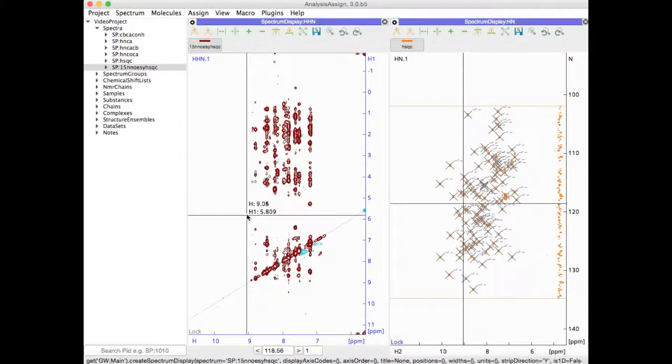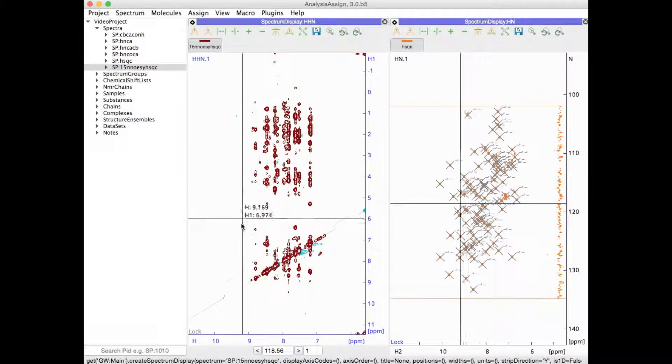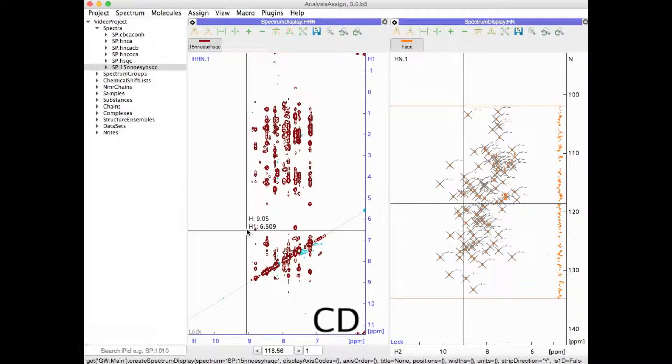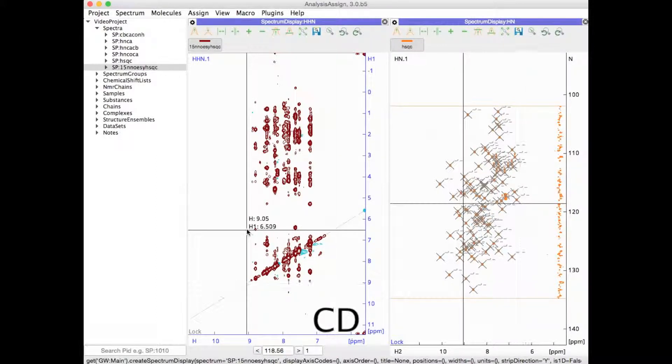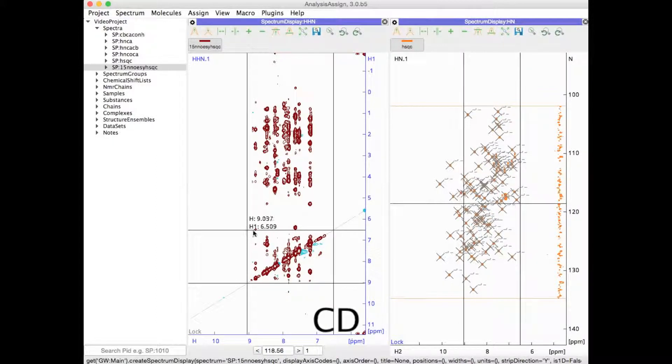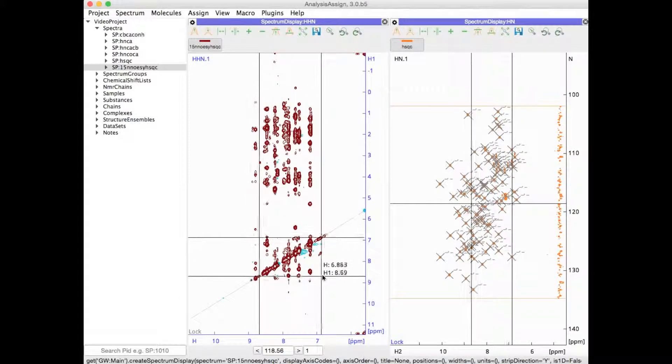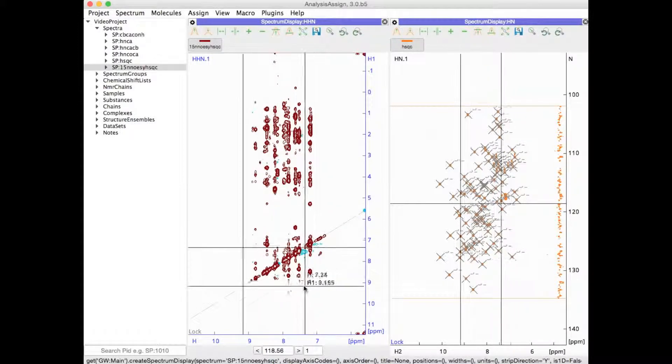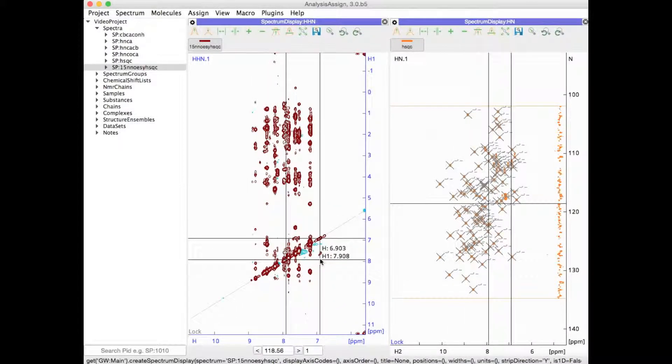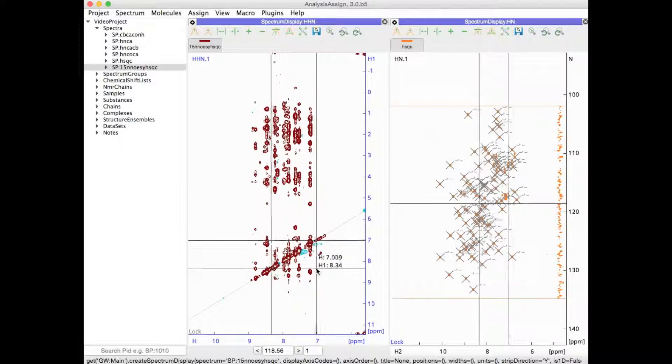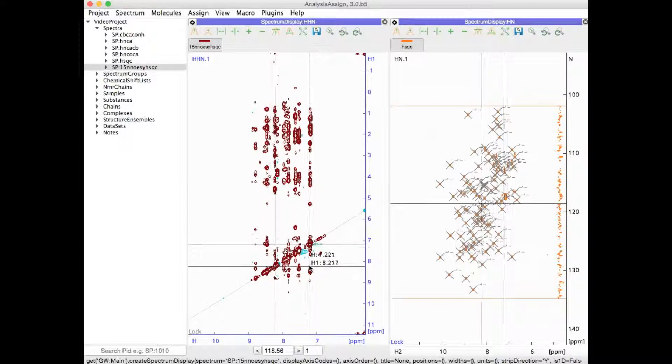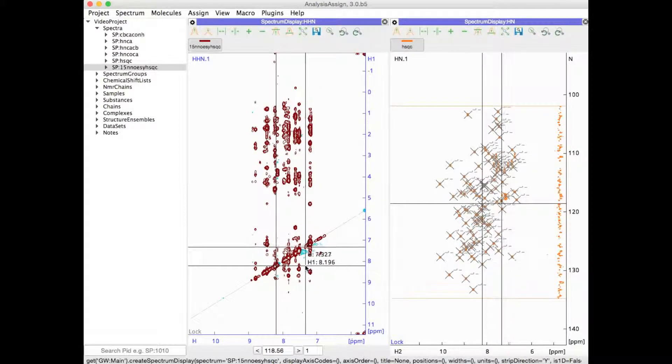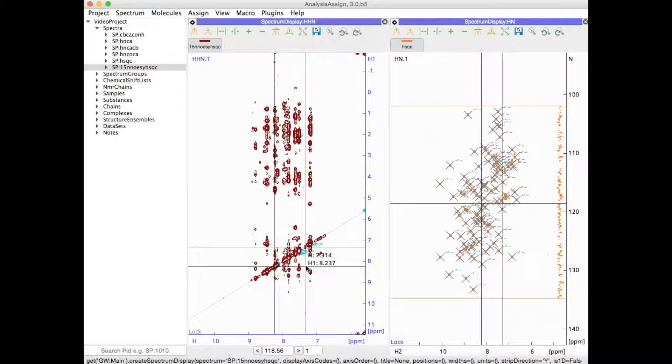You can also change your standard crosshair into a double crosshair with CD. This will toggle it on and off. This means that in a spectrum where you have a diagonal you get the crosshairs on both sides of the diagonal, and both chemical shifts are then marked in the other spectra.